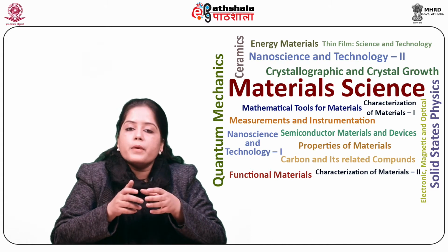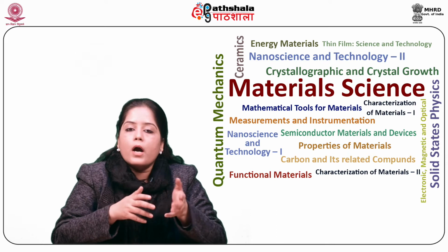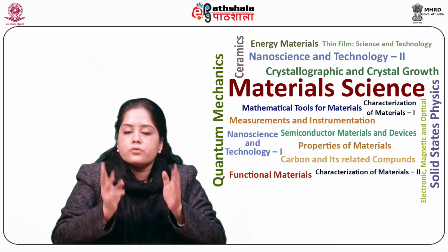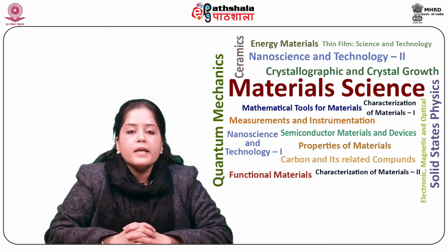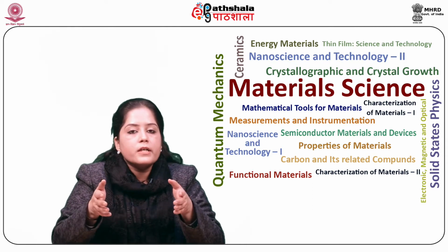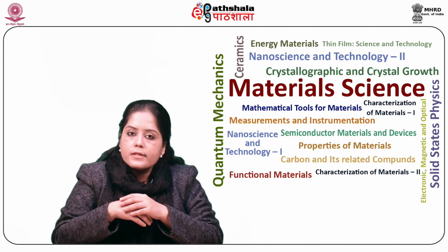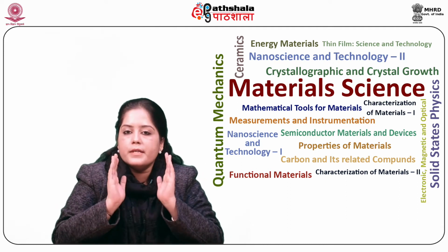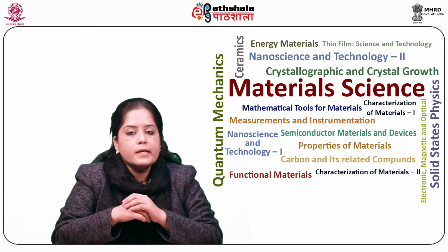It also depends on whether a ferroelectric is confined in one, two, or all three dimensions. So, to address the fundamental mechanism underpinning the functionality of ferroelectric materials and devices, domain structures and their evolution under bias have to be studied at the micrometer and nanometer scales.